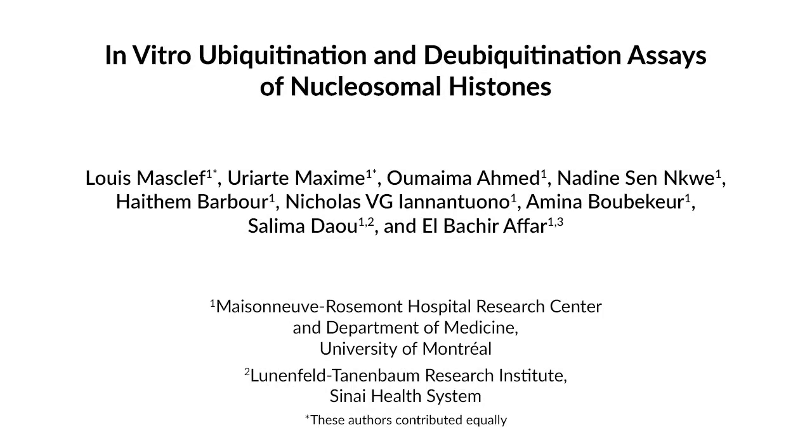Given the complexity of the ubiquitination and deubiquitination reactions inside the cells, it is important to establish in vitro assays with defined purified components. This helps to understand the mechanisms of ubiquitination and deubiquitination, and also to determine how mutations associated with genes that encode the enzymes responsible for this reaction can cause human disease.